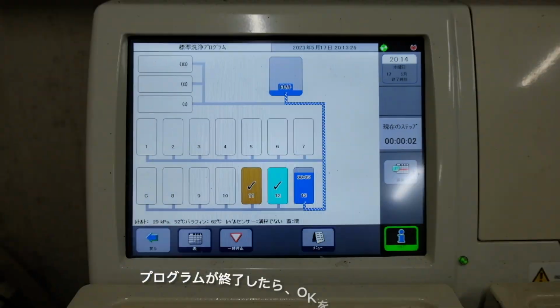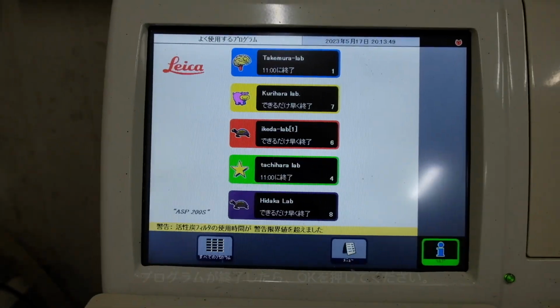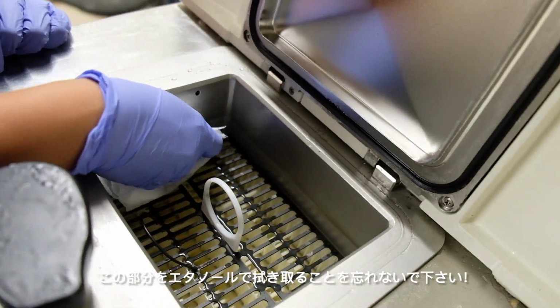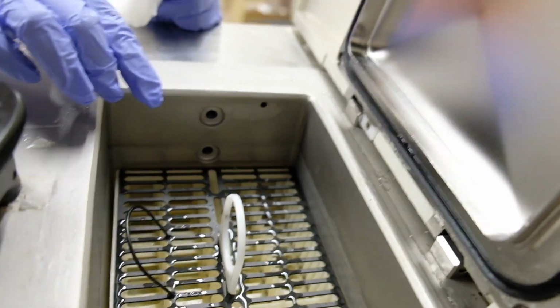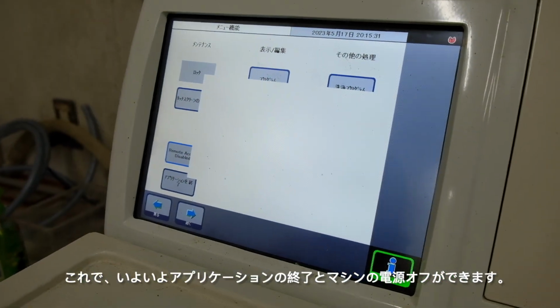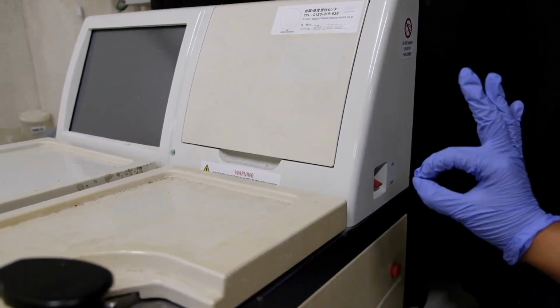A few moments later. Once the program ends, make sure to click OK with the pop-ups, and we're ready to finish off. Once the cleanup program ends, don't forget to wipe this part of the machine off with ethanol before closing it up. Finally, once that's done, we can start to close up the applications and power down the machine.